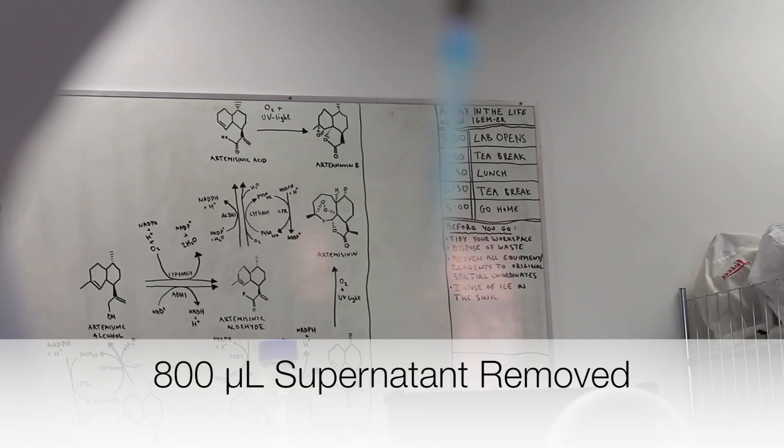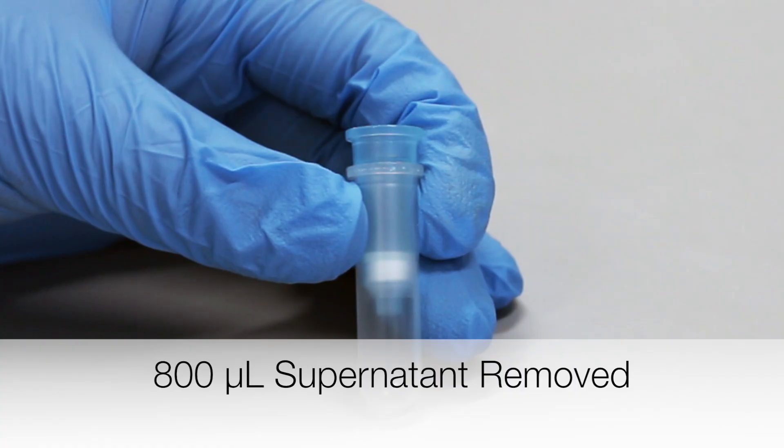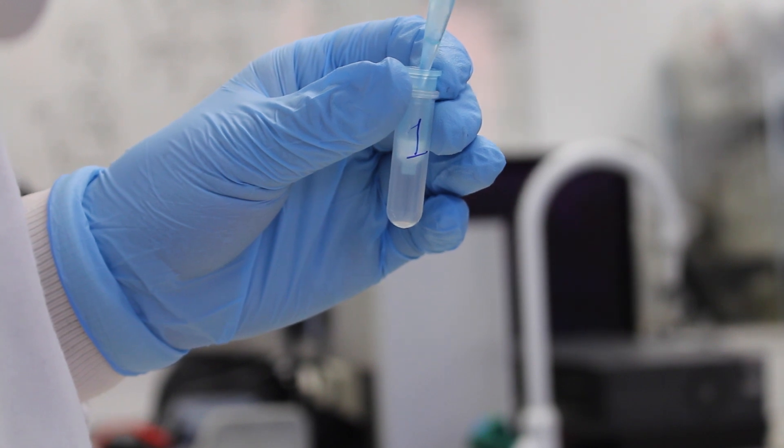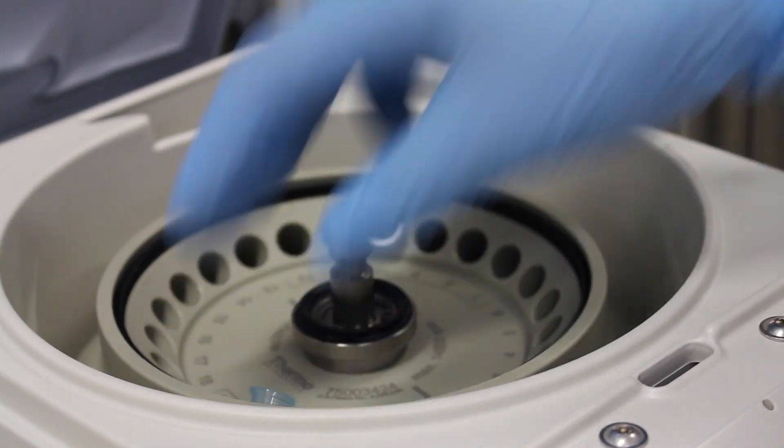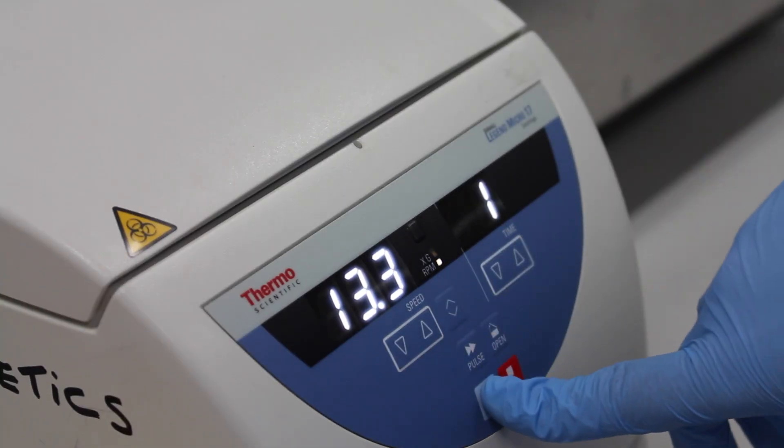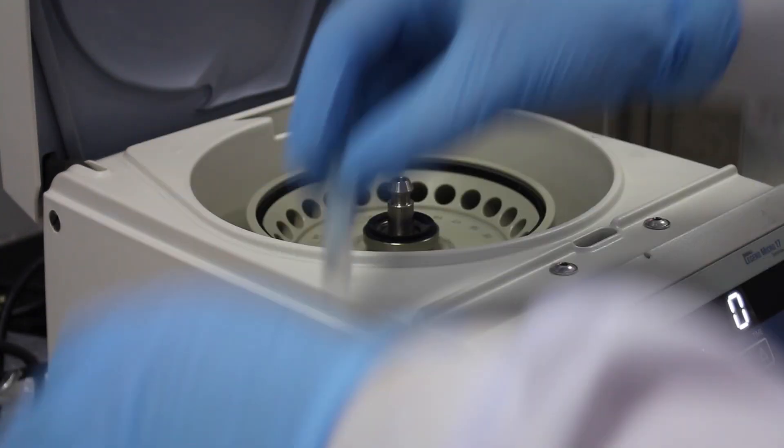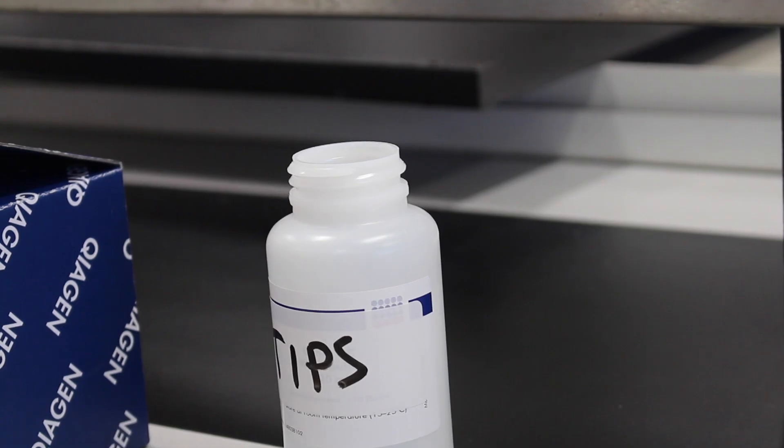800 microliters of the supernatant is then removed and transferred into a QIAprep 2.0 spin column. The samples are put into a centrifuge and centrifuged for 1 minute. The flow through is discarded.